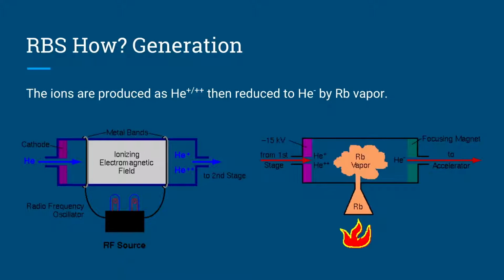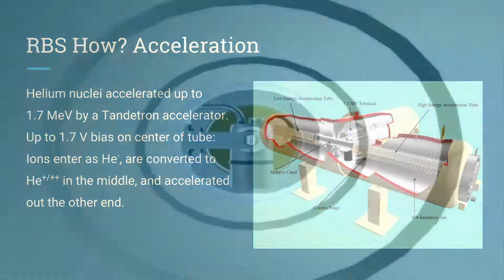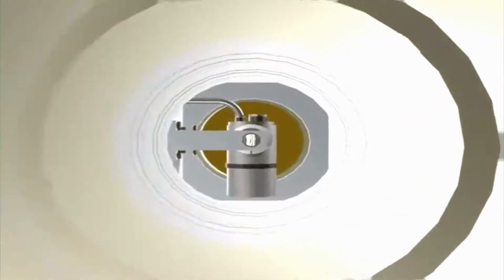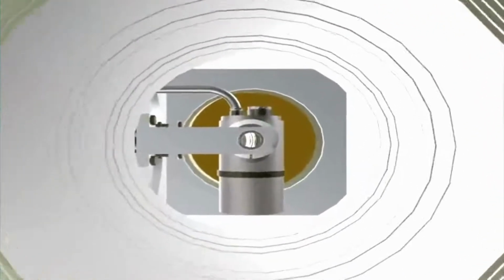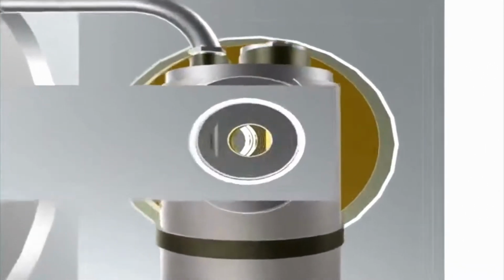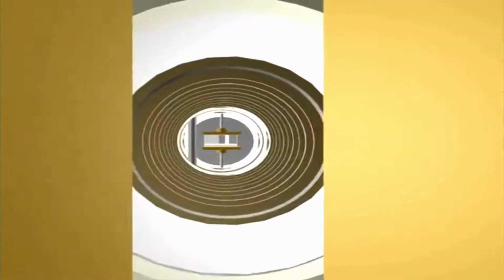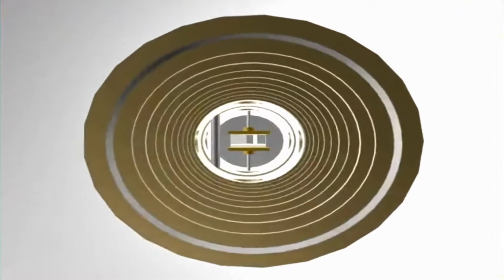The collision of the ions with the sample produces backscattered particles which are then picked up and analyzed by various detectors. The Tandetron acceleration tubes are constructed by sandwiching titanium electrodes between glass insulating rings. The electrodes have a central hole which allows the ion beam to pass through, several cutouts, and hold magnets to suppress secondary electrons. The assembled tube structure evenly distributes an applied potential by resistive grading, which connects a resistor chain across each electrode and smoothly distributes the total voltage from terminal to ground.